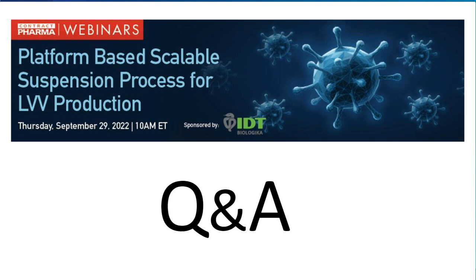So this is easy to achieve, of course, when you're doing those small-scale studies, but when you scale up, it is still important to not let that complexation time exceed preferably 30 minutes, because within that time it still stays pretty close to what we have seen in the small-scale studies. But if you go more than 1 hour, it definitely adversely impacts the titer. And we have some data for 2 hour complexation times, and we observed a 20% reduction in the transfection efficiency. So you certainly don't want to go preferably more than 30 minutes, but certainly not more than an hour. That will reduce the titers.